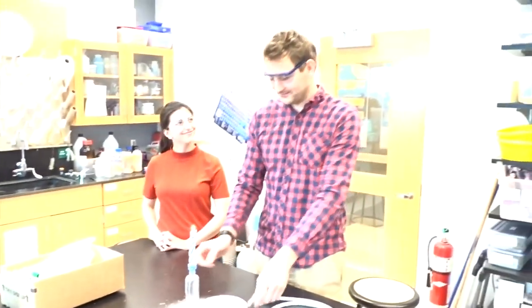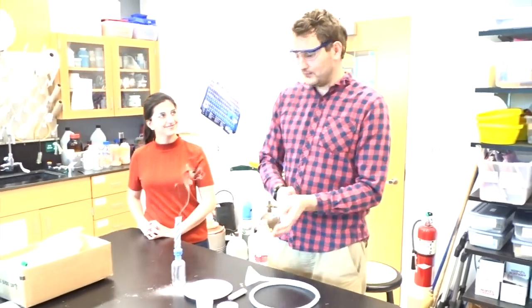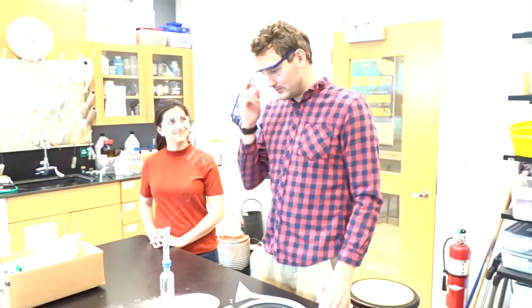Yeah. See how it burns. You might want to practice with that before you do it for the first time, and make sure you wear safety goggles.